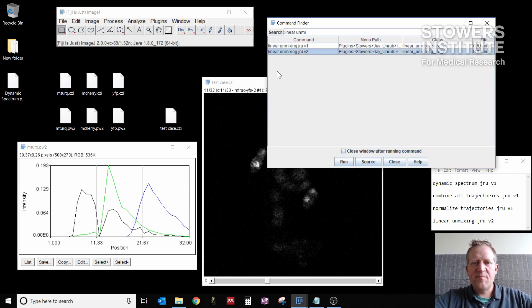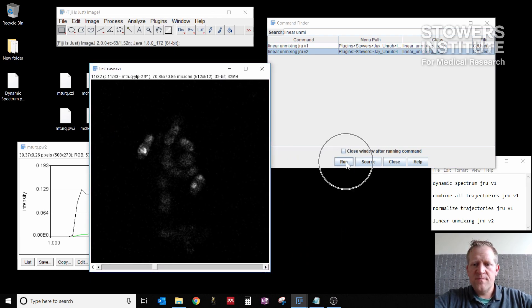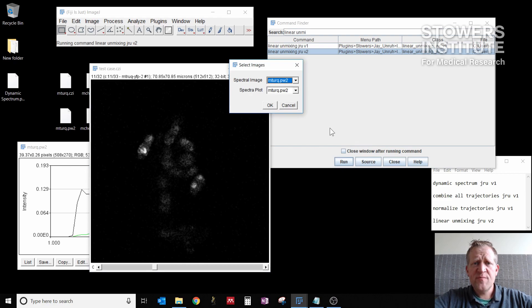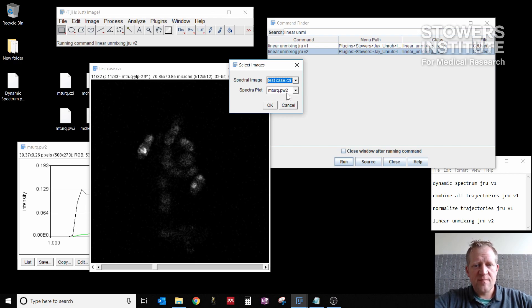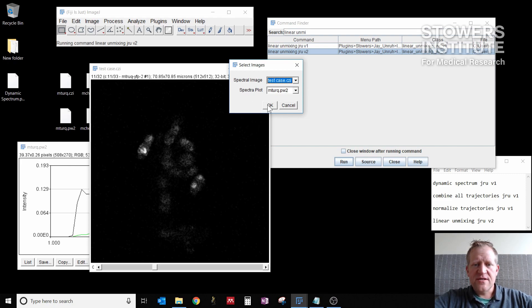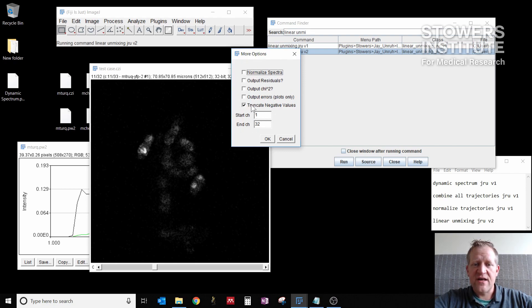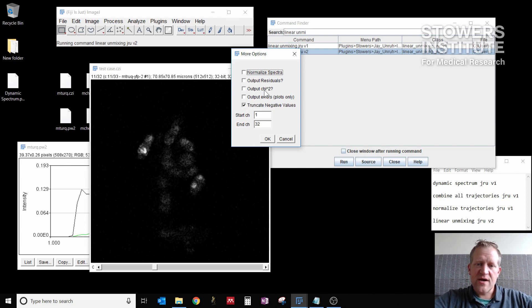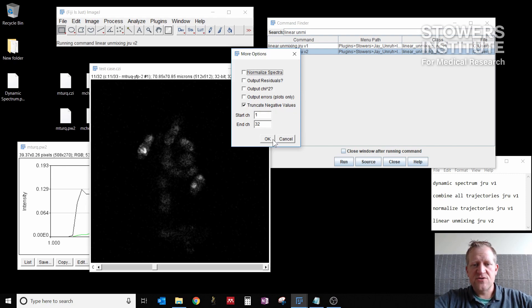So I select that plugin. I'm going to select my window and click run. The two inputs here, I need to select my image in the image window and plot in the plot window. So test case is my image and my PW2 file is my spectral plot. So I click OK. I have already normalized my spectra, so I want to deselect that, but I do want to make sure that I leave truncate negative values on. You can use the residuals, the chi-square and the errors as troubleshooting options to see if there's a spectra in there that you're not accounting for. But this is my default case to use. I want to make sure that I go from 1 to 32. So I click OK.